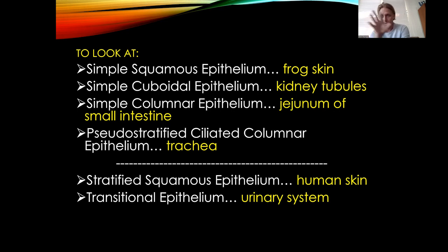I want to just kind of put an asterisk next to this one. A lot of students are confused at first why I'm using frog skin, but I'll explain it when we get there. Also, it's not going to look simple squamous to you, and let me explain why that is when we get to that slide when I show you this image.